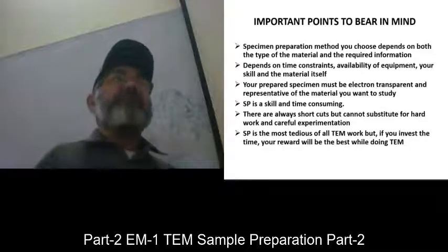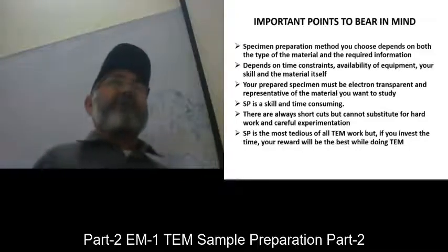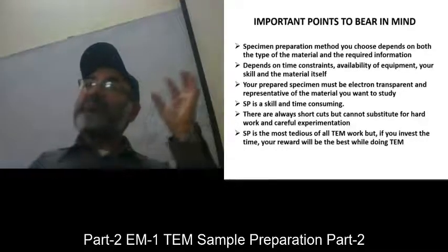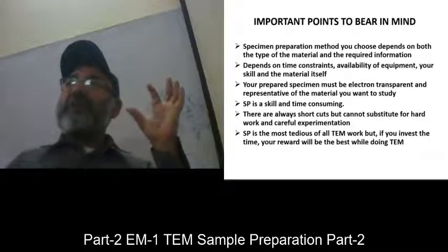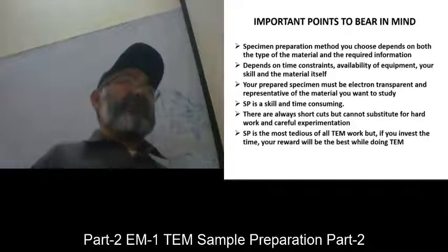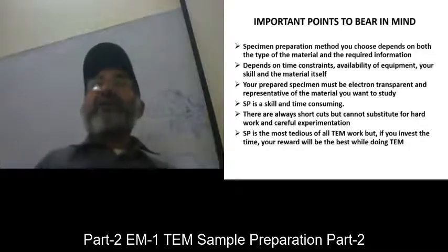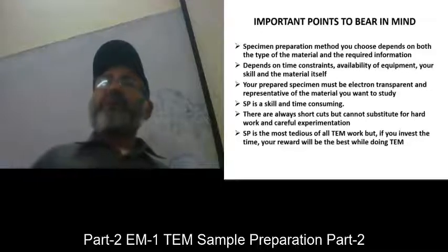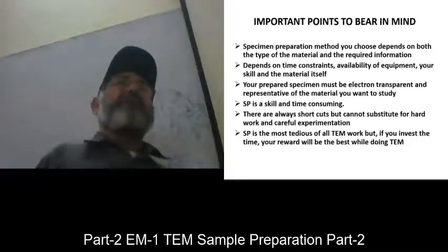All of them may not be doing electron microscopy, but most of them may be. So there is your time schedule, and you can't run a machine for a week or a month. You will get a day, half a day. In our times, the booking time was, for example, from morning to evening.